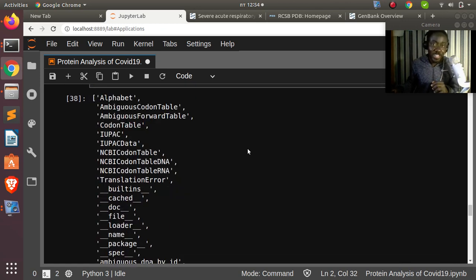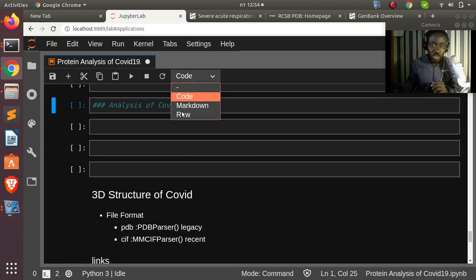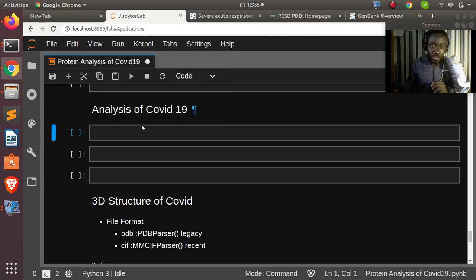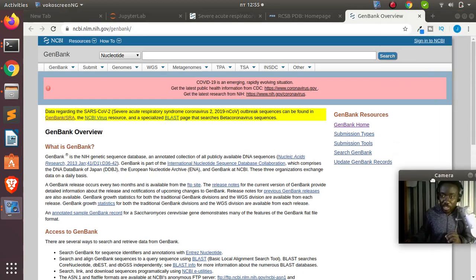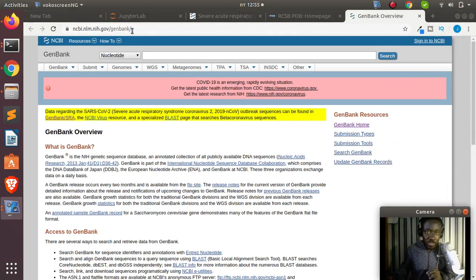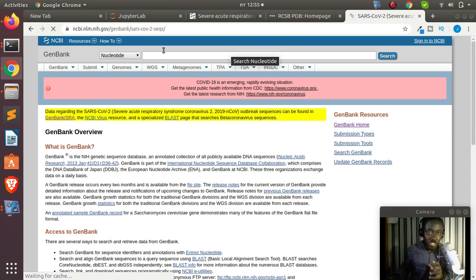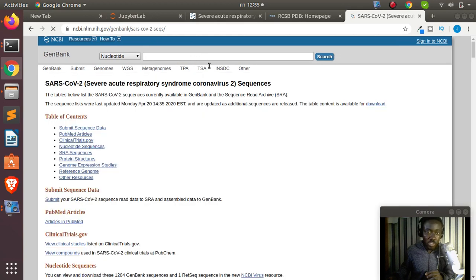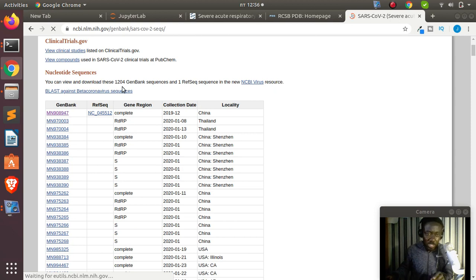Now let's move on to our main task — analyzing coronavirus (COVID-19). To get the actual DNA sequence, go to the GenBank database (NCBI). You can see the COVID-19 complete genome sequence listed there — there are sequences from China, Philippines, Japan, and more. We'll use the complete genome from China.